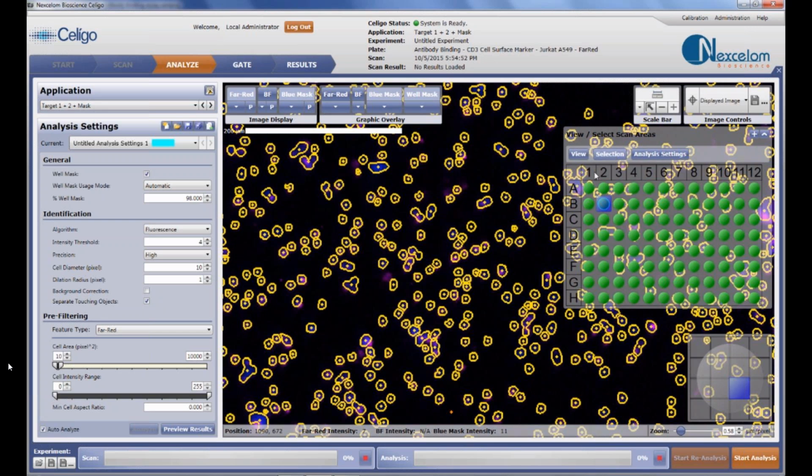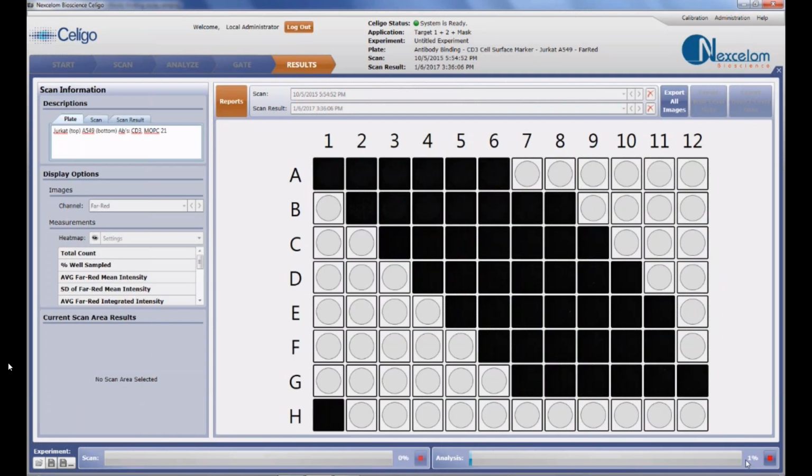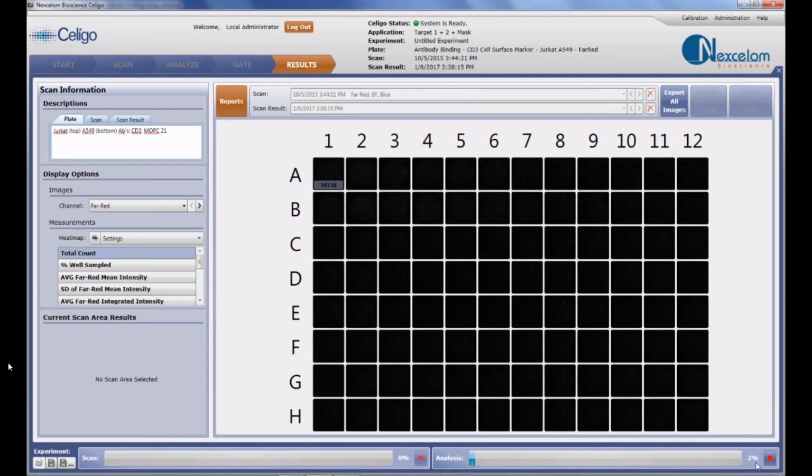Okay, so that was pretty much the only parameters that I changed for this application. The default values, or actually that would be 3. Those are the only 3 values that I changed. Everything else seems to be pretty good. If you miss a few, it could be cells that are clustered together or too small. It's okay.